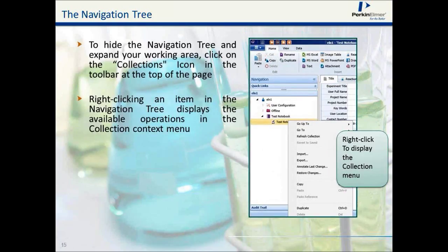So this is regular, as we saw in the last version of eNotebook. You are able to hide the navigation tree and expand your working area by clicking over here.